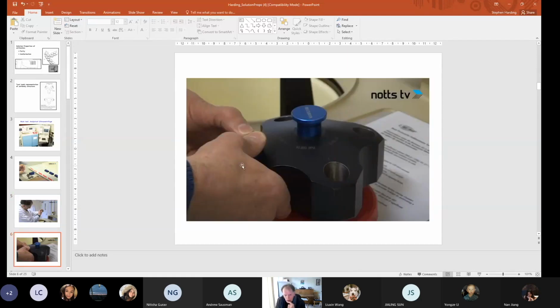And then you put your cell, when it's loaded up, into a rotor, and notice there's several holes in the rotor. Any centrifuge has to be balanced, so the weight this side has got to be balanced by an equal weight the other side, and you can balance it with another cell which has got a similar amount of material in, and there's room for more as well.